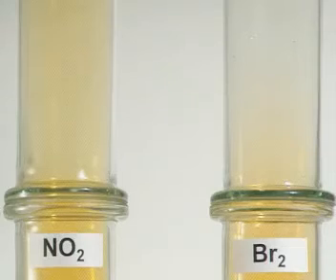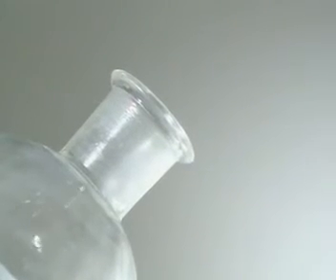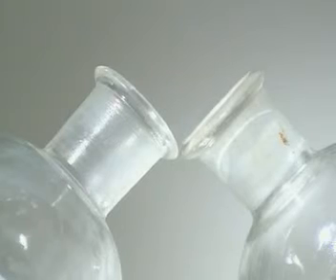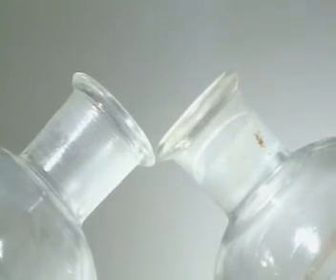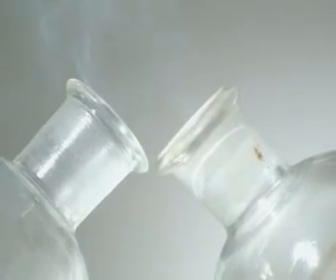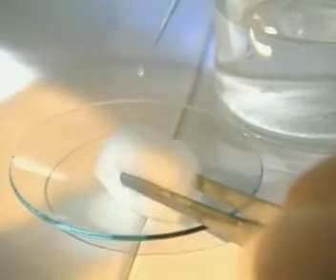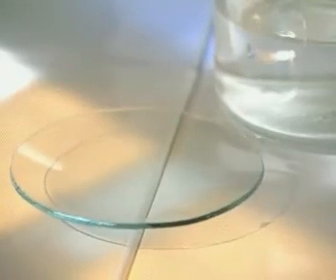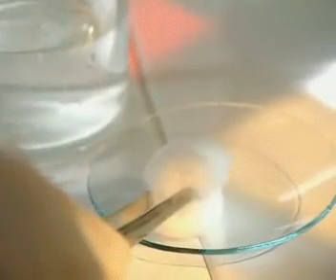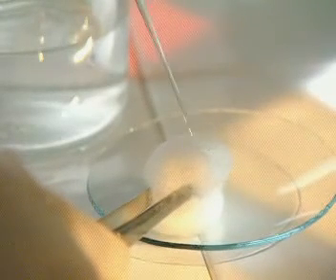We can also compare the diffusion rates of other gases. Ammonia and hydrogen chloride gas are colourless, but when they meet, a white cloud of ammonium chloride forms. A piece of cotton wool soaked in concentrated ammonia solution provides ammonia gas. Concentrated hydrochloric acid provides hydrogen chloride gas.